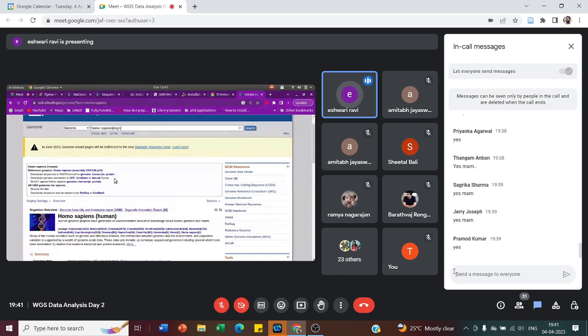In whole genome sequencing, the reference based approach which we are doing, we need the entire genome in FASTA format. So I will click on genome. Now there are again two ways. I can either copy the link and paste it in the terminal, or I can directly click it on Windows and it will just download it for me.